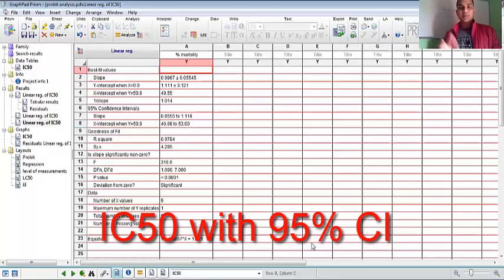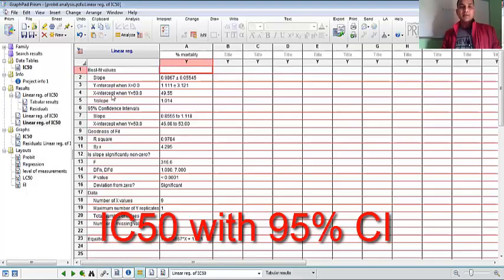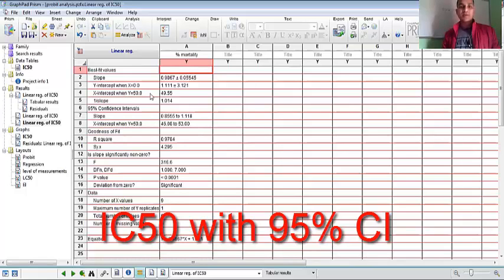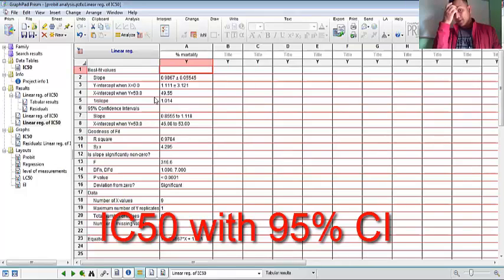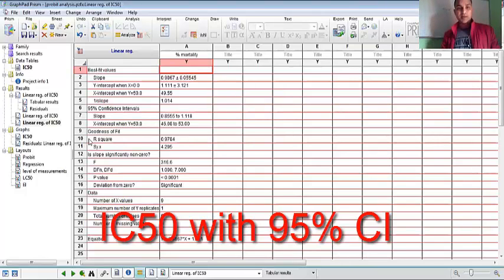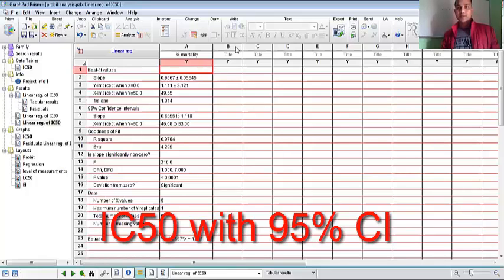It's very simple. Here's the result of IC50. Here the concentration is 49.55 and their corresponding 95% CI. Here's the result of CI. I hope that you understand. It's very easy.